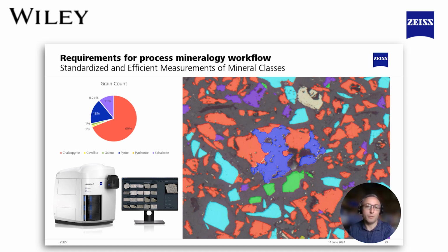And the nice thing is that the really important change from semantic to instance segmentation is that the semantic segmentation was really reliant on seeing the same mineralogy. So if I wanted to build a 3-mineral classification based on a semantic segmentation routine for a thin section that had those 3 minerals in it, if I then had a 4th mineral in a new sample, I wouldn't be able to use that old model. It would try and absorb that 4th mineral somehow into whichever is the nearest classification.